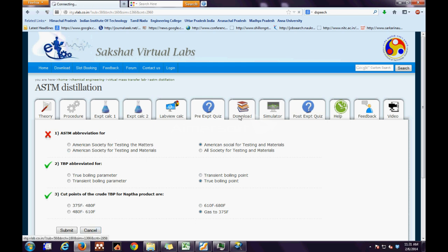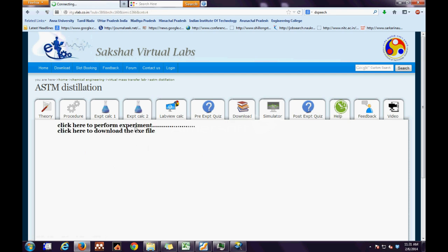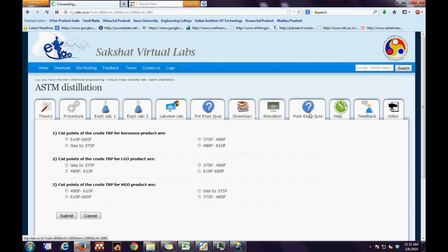The next step is the downloads tab. In the download tab, the user has to download the runtime engine for the simulator to run. Next is the simulator tab. Here we have two links: one is to perform the experiment online, and the second is to download the .exe file and then perform it offline.